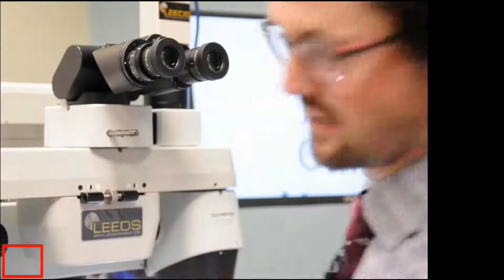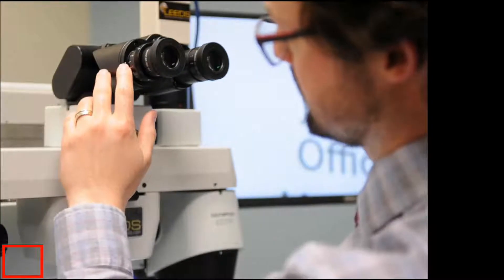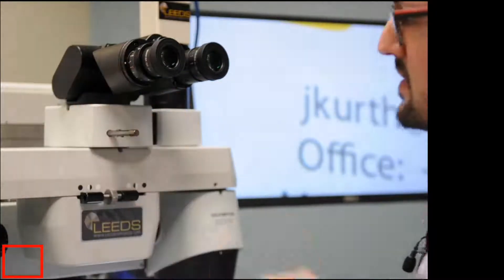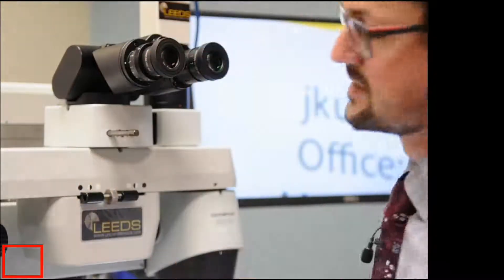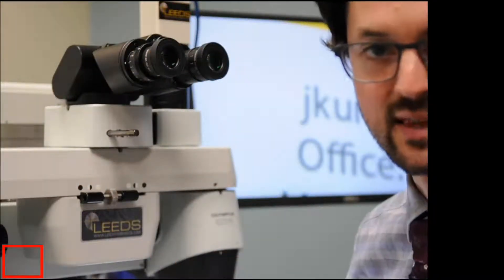And then my left eye, if you can actually, I don't know if you can see it so well, but you have the diopter, you have a white index here, and your diopter number is printed on the side. My left eye is actually a negative one. So a little bit off from my glasses.